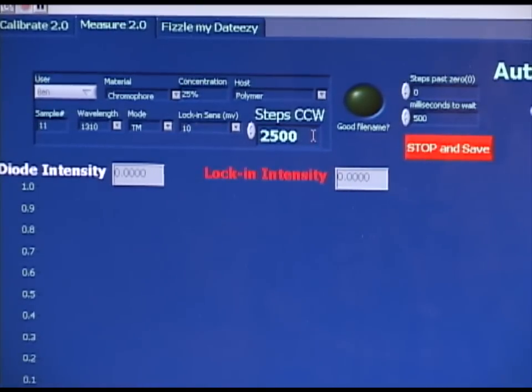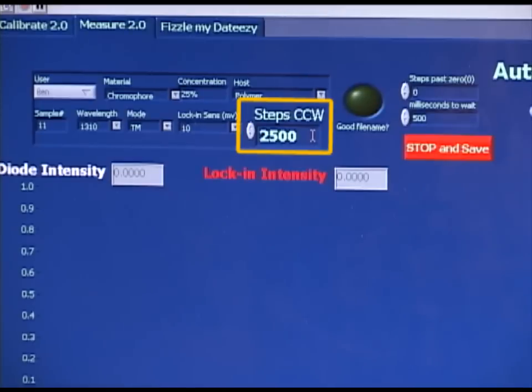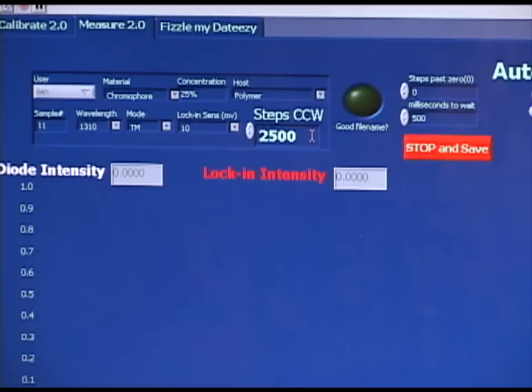In the lower right-hand corner of the information box, we can see a box labeled Steps Counter-Clockwise. This tells the stage motor how many microsteps to move beyond the zero point. If during the calibration process we find modes at very high angles, it may be necessary to increase this number. Often we increase it to a number as high as 2850 microsteps. However, a more standard number is 2500 microsteps.